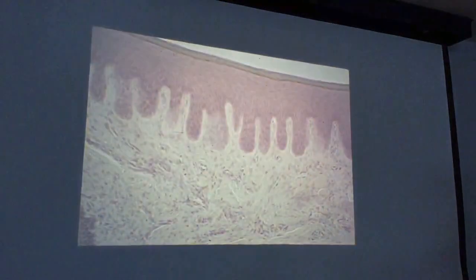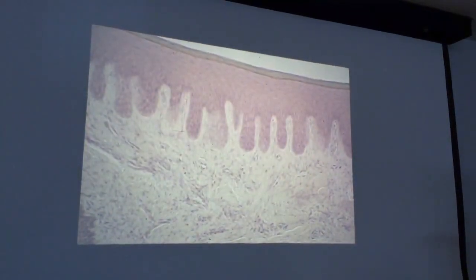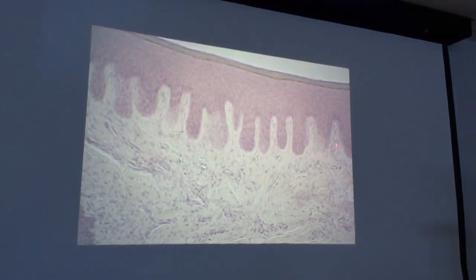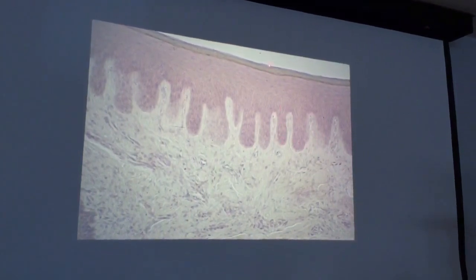And how about this tissue we see right there? Enamel. And what are those? Lines of Retzius, and that is the DEJ. Of course, we've got some other stuff that we had on the last lab practical. Okay, well, what are these things going up? Yeah, connective tissue papilla, and this tissue is what?